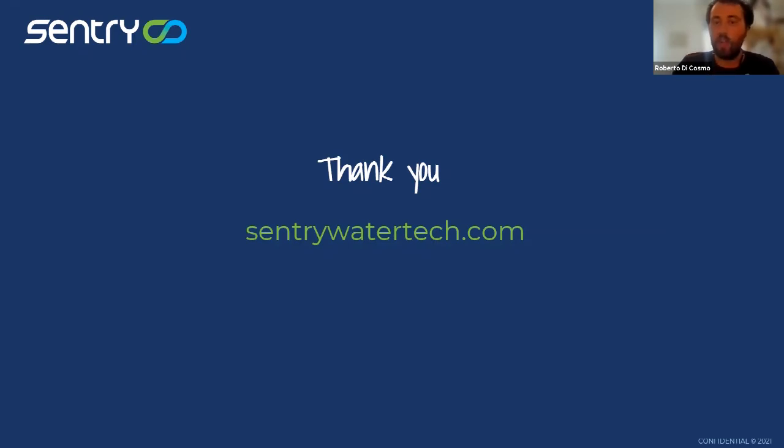So it's true, you can forget about the maintenance, at least for these 5 months for us. And of course, the other thing that I want to suggest is the potential of this kind of sensor to measure correlation and everything else, because we're just looking at some aspects of this possibility. We have many possibilities in disinfection, in anaerobic digestion, in co-digestion, I hope in the next few months or few years. So this is a big point for everybody, I think: the possibility that is open with this kind of sensor.